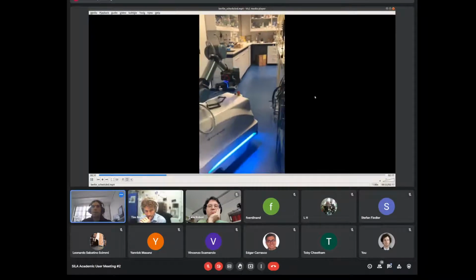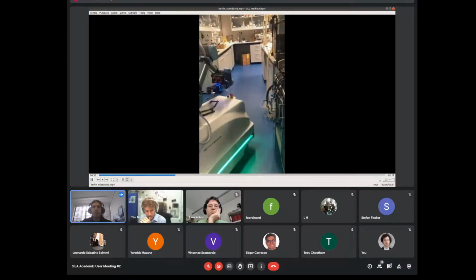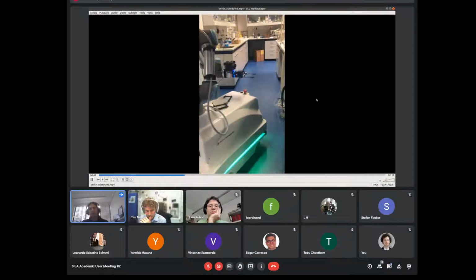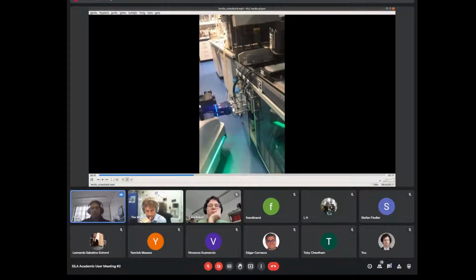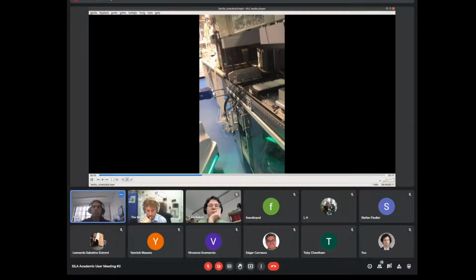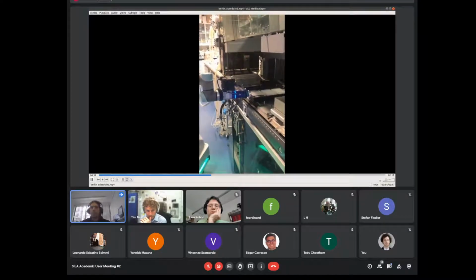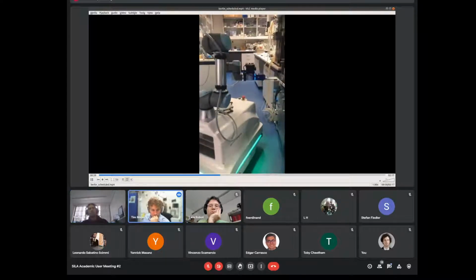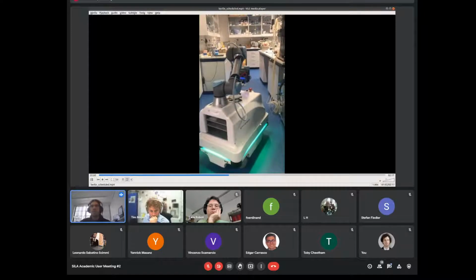It's, to be honest, quite sensible. So the kinematic software isn't that good. I think so. It sometimes gets lost in the lab. Here you see how it checks the barcode and then goes to the plate. And sometimes the arm goes into singular positions, or it runs into obstacles, so the whole device stops.